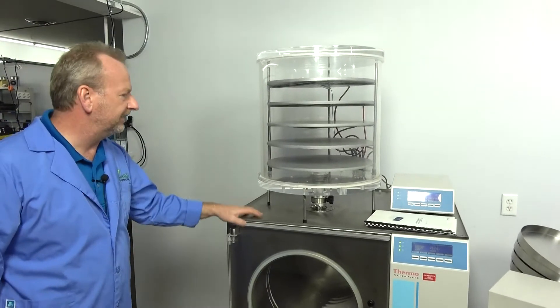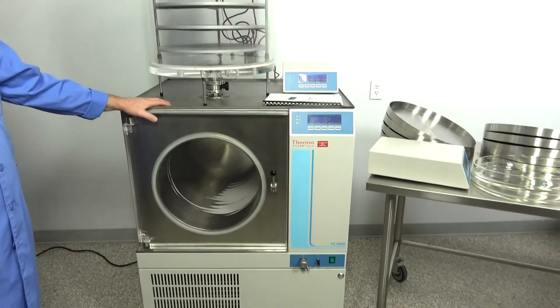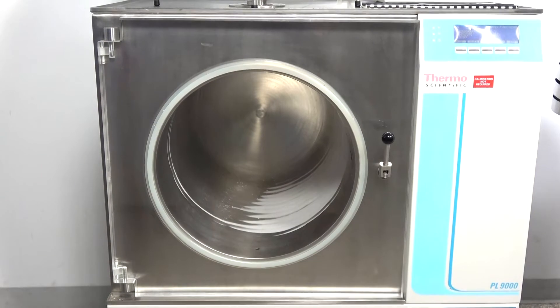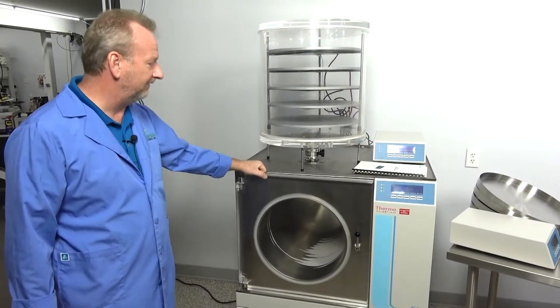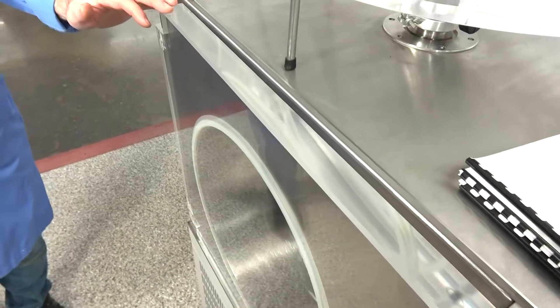It's a huge drying chamber with a huge condenser area, so you can really pull in a lot of moisture before you go through the defrost cycle. It's just a straightforward, heavy-duty machine with one of the biggest and heaviest plexiglass lids I've ever seen on a freeze dryer. It works really well.